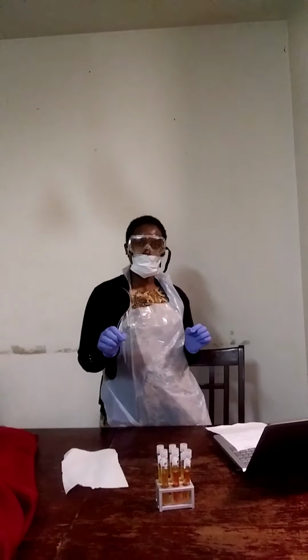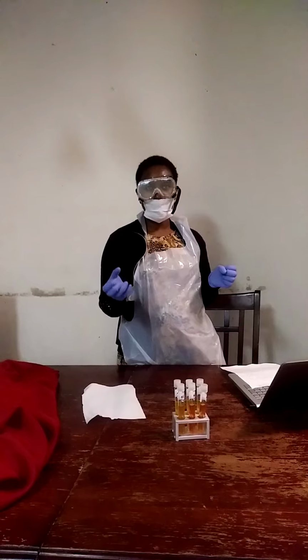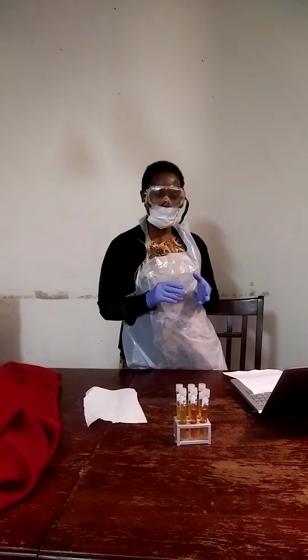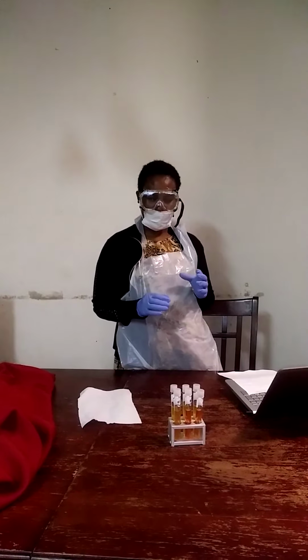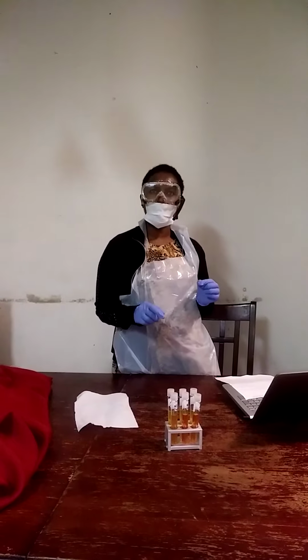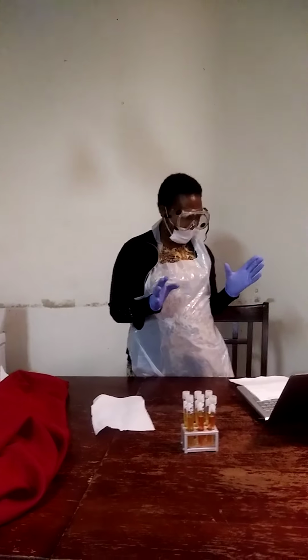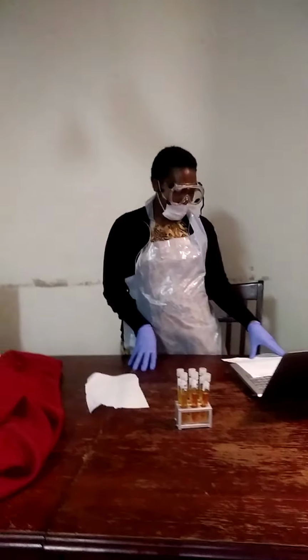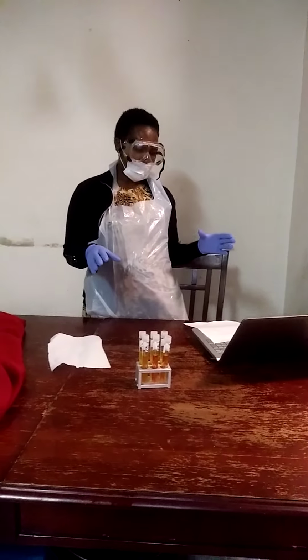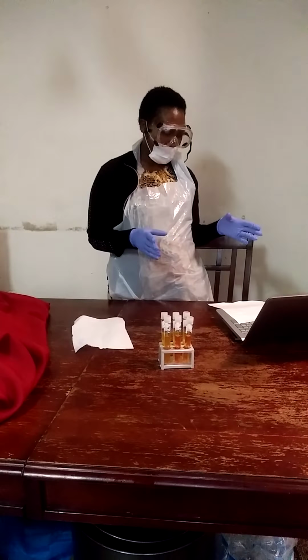And in each tube also I had my cultures that I had already prepared. That is the yeast and the Staphylococcus epidermidis. And I followed the instructions, and I inverted in each tube a Durham tube, of which the Durham tube is for testing or to determine the product, whether there is the production of gas in the medium.